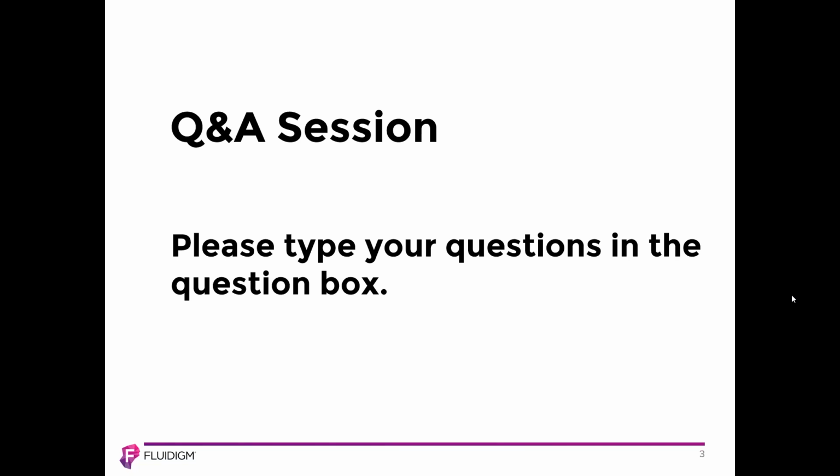So the next question looks like it's going to be another question for mass cytometry. Anita, this is for you. Is MDIPA only for PBMCs and whole blood? What about tissue sections? Oh, that's great. So we have definitely validated that MDIPA panel for PBMC and whole blood. And there is a lot of literature available on our website. The protocol, everything is available. But if you're thinking about TILs or the immune cells that you take out from the tissues.